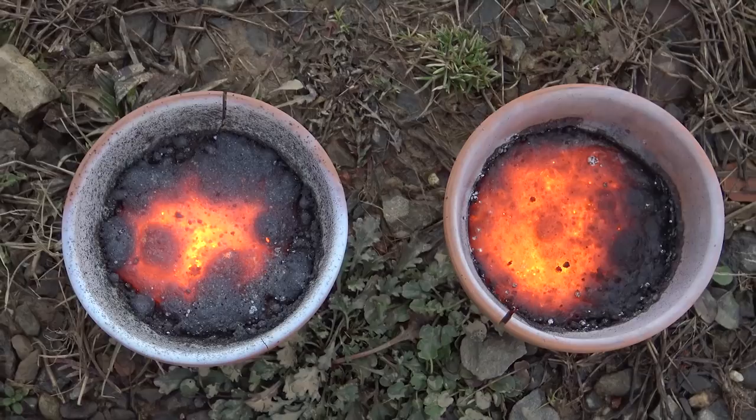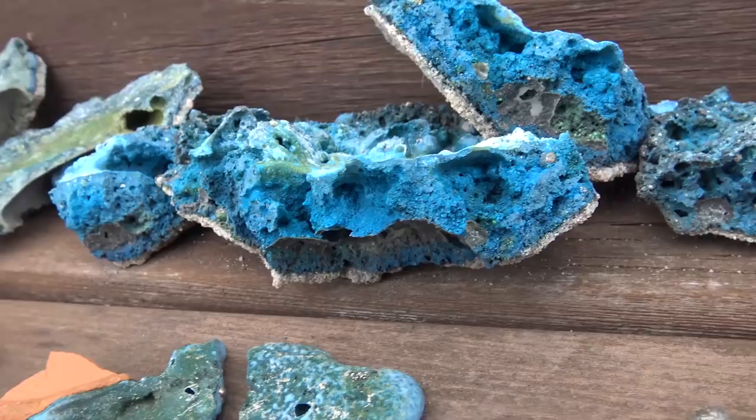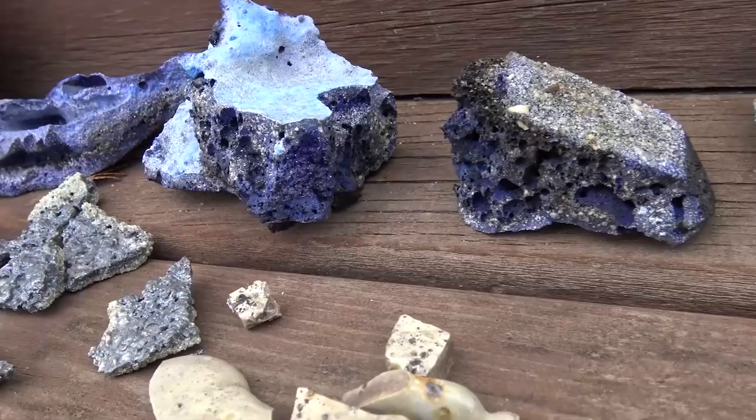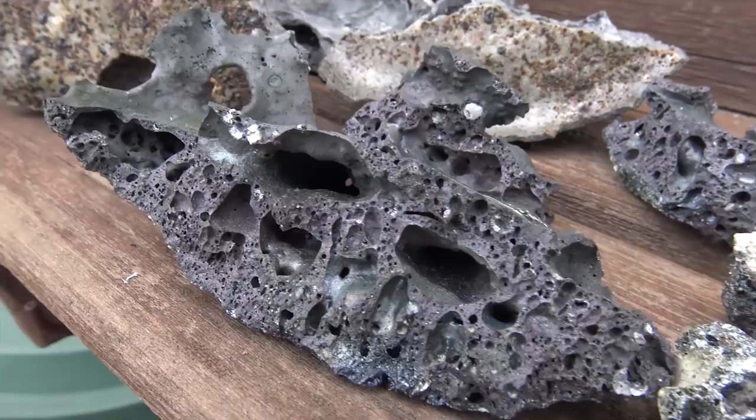Well, if you're like me and wanted to collect all of the elements, but felt like buying some of them was just a bit too easy, well, here we are. I've got over 100 pounds of different types of thermite to extract the metal from, from the most basic manganese extraction to perchlorate-boosted zirconium thermite to silicothermic reduction of bismuth to a lot more I don't want to give away just yet, because I think I've got some great ideas, and Grant, I know you're watching. Now let's get right into it.